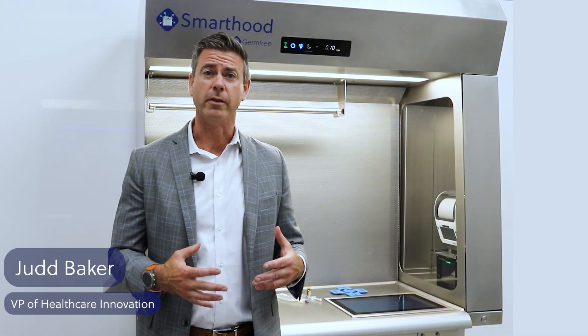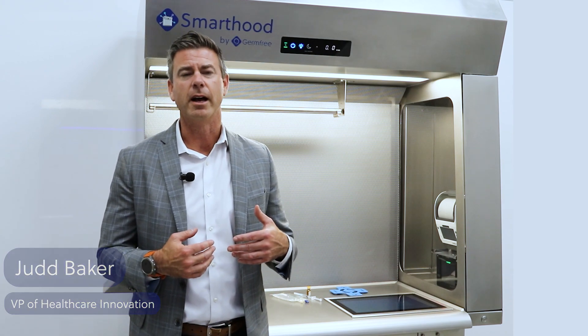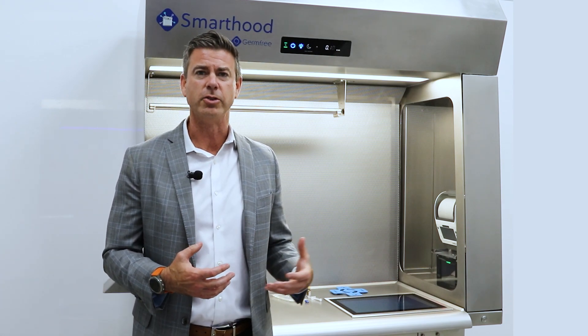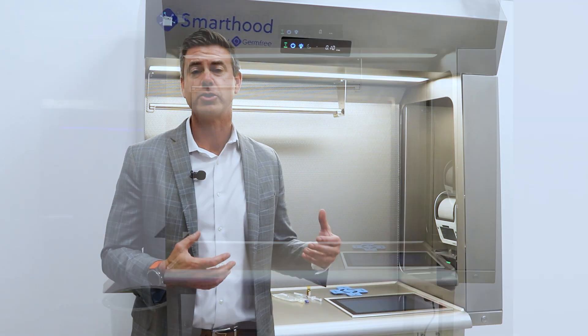Hi, my name is Judd Baker. I'm the Vice President of Healthcare Innovation here at GermFree, and I'm excited today to introduce you to the world's first software agnostic smart hood.